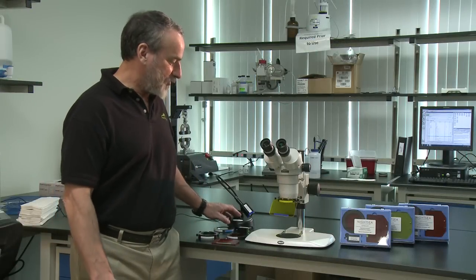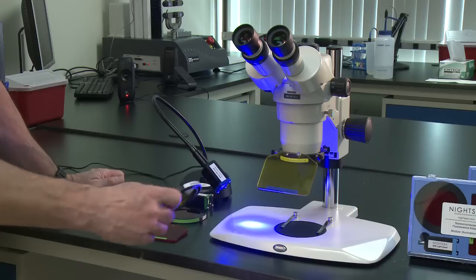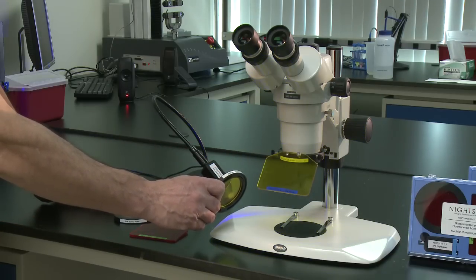There are just two elements required for fluorescence: a light source that will excite the fluorescent material, and a barrier filter that will block the reflected excitation light and transmit only the fluorescence. The NIGHTSEA Stereo Microscope Fluorescence Adapter is a complete modular solution that provides excitation light and a simple means of inserting the barrier filter in the emitted light path.